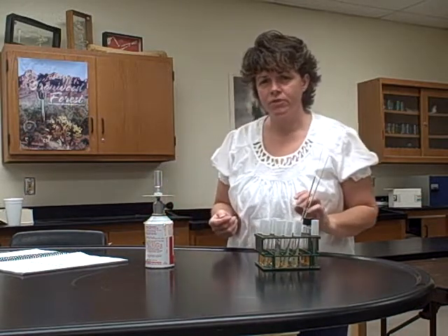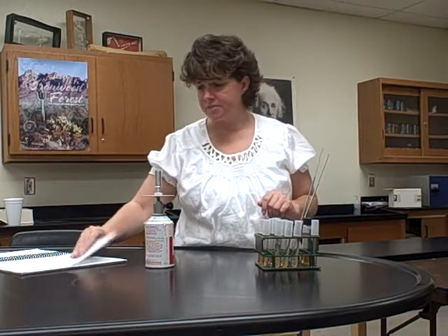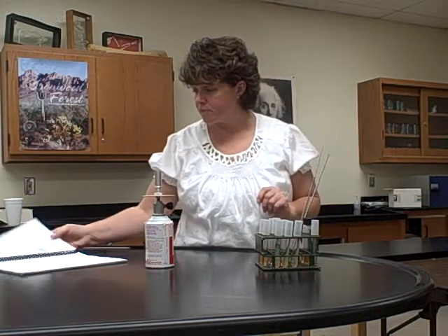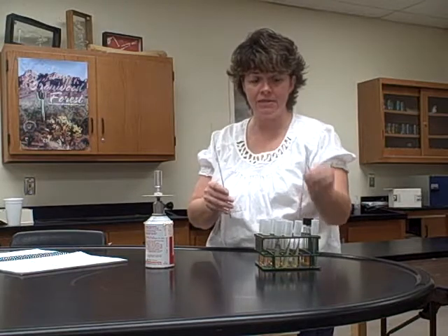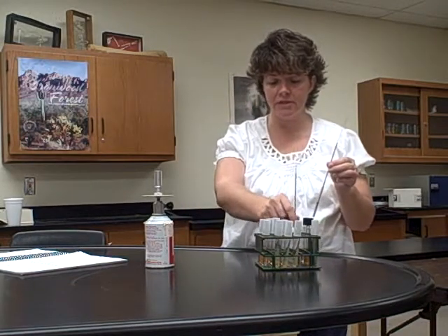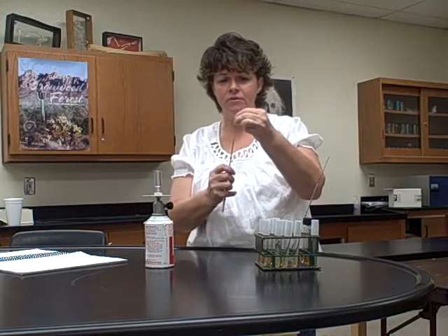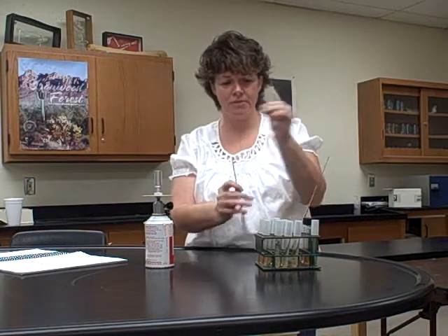So the first lab that we're going to do today is the transfer of bacteria using aseptic technique, starting on page 71. For this particular procedure, we're going to need both the loop and the needle. We haven't used the needle yet, so it's just like the loop except it's straight. You want to make sure you have it as straight as possible. We don't want too many bendy loops.